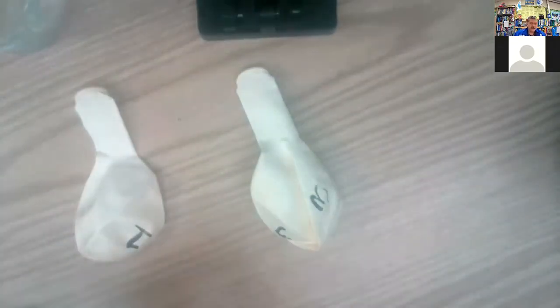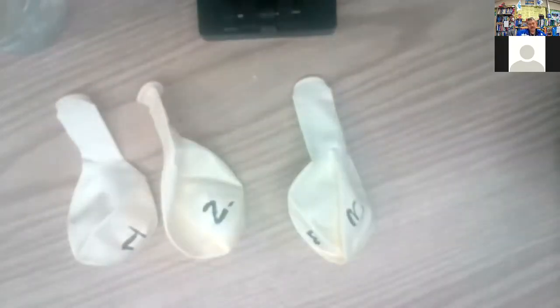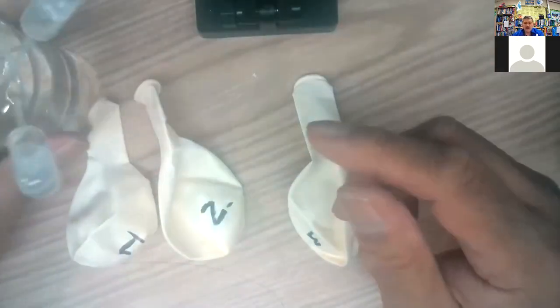Let's take a look at what we got. We got number 1 over here, number 3 right there, and number 2 right here. Now what we're going to do is squirt 5 squirts of water from a barrel pipette into each balloon.